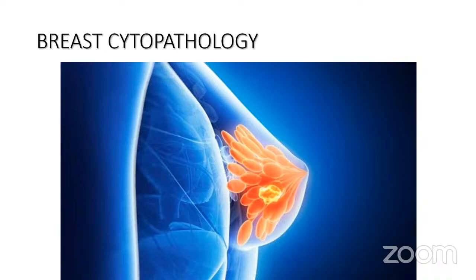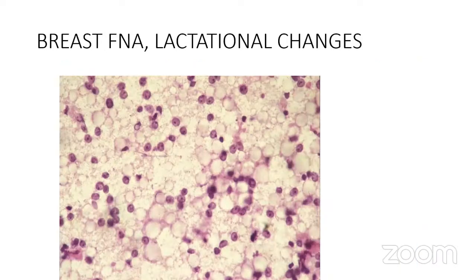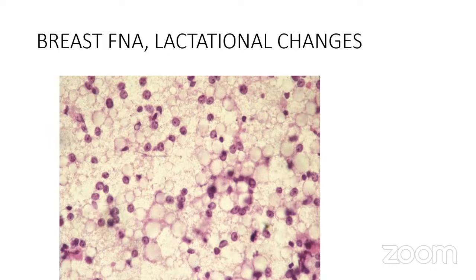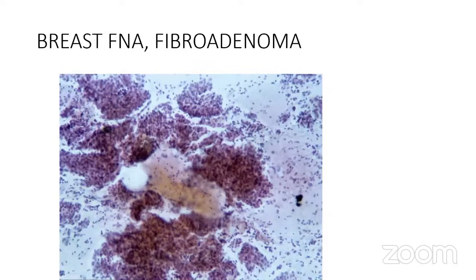Breast cytopathology: lactational changes can be a pitfall. The aspirate is very cellular with lots of bare nuclei with prominent nucleoli, but notice the frothy background — these are milk globules. This is from a patient who may be nursing or pregnant. Fibroadenoma is another potential pitfall — a very well-defined breast lesion that can yield a very cellular aspirate.